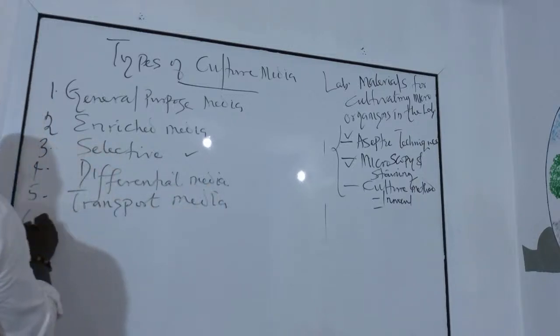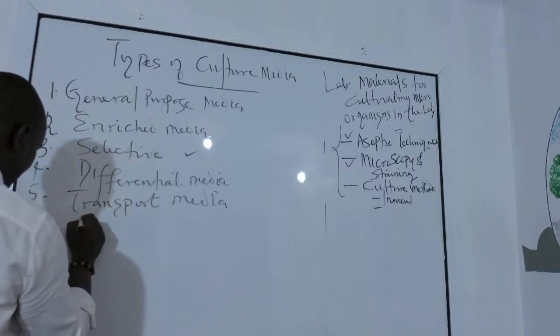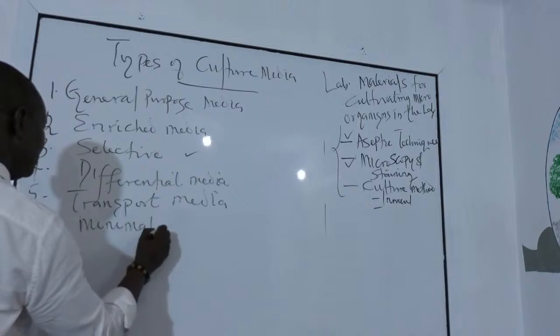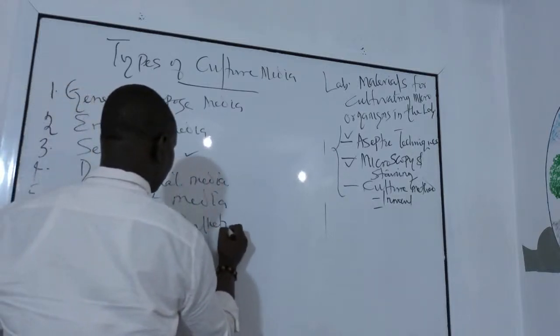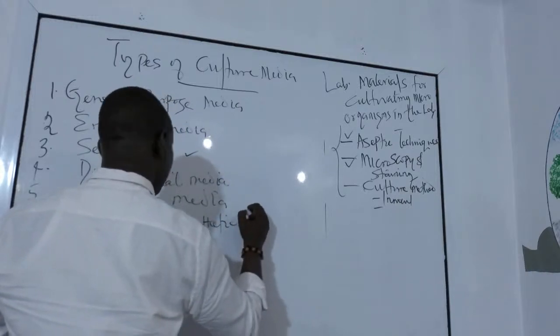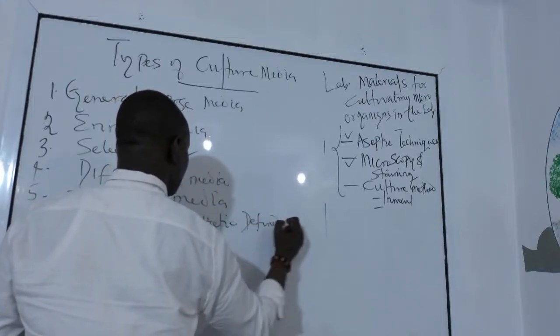Number 6, we have minimal synthetic defined media.